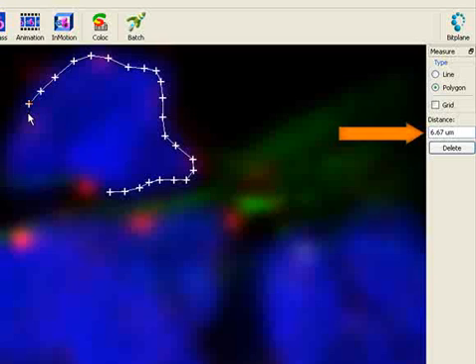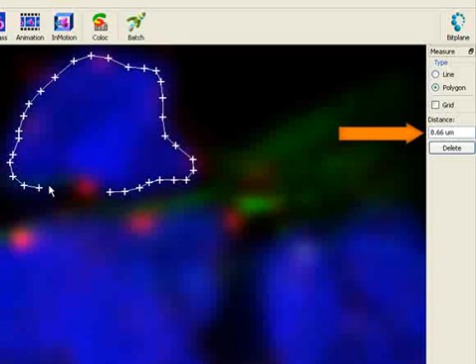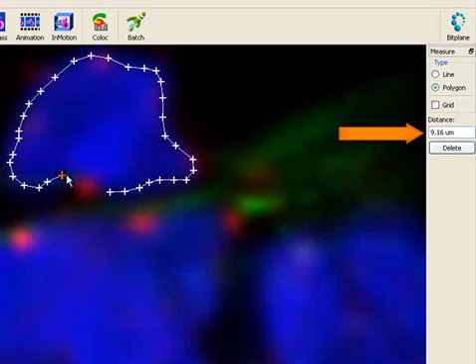Draw a polygon around. The result displays in the distance field.